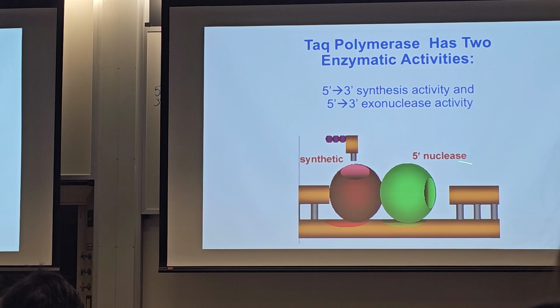Any questions about this? So the primer is right here. This is the primer, and this is the probe. I have better diagrams in a second. So, let me just show you the next one, we'll see if it clarifies.